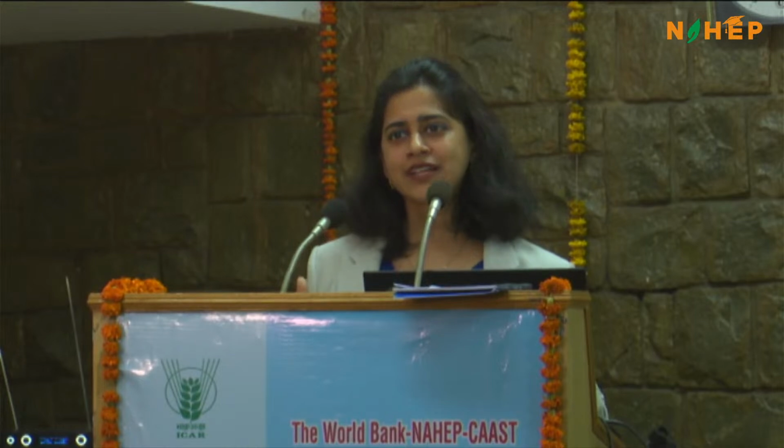So I will take closely related organisms, make a database out of it, and remove it. I'm not taking just one in this case. I'm taking multiple so that I remove as much as possible, but I know still it will be there. So I can remove it at the gene level.